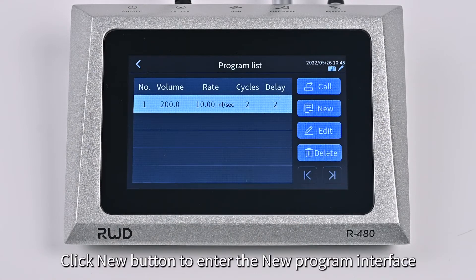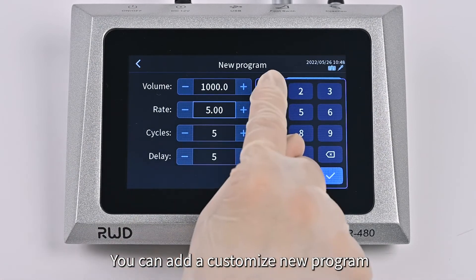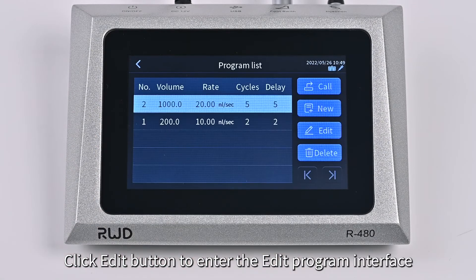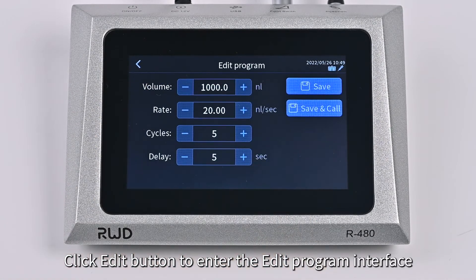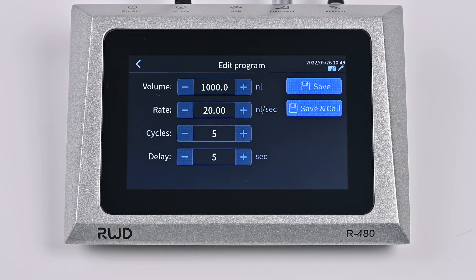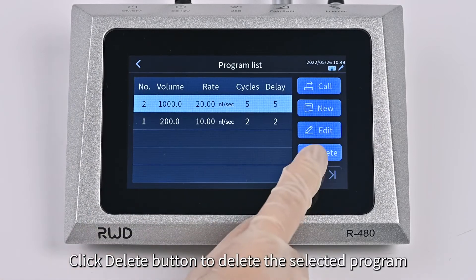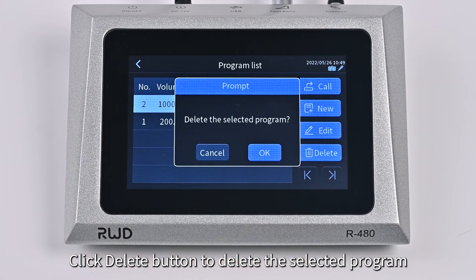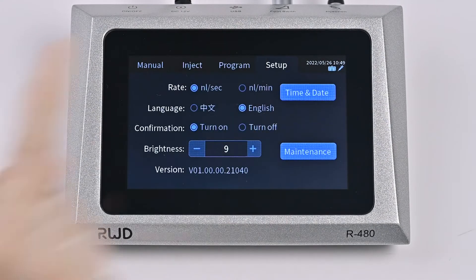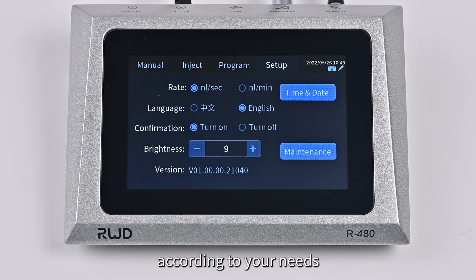Click the New button to enter the new program interface, where you can add a customized new program. Click the Edit button to enter the edit program interface, where you can modify the existing program. Click the Delete button to delete the selected program. Enter the Setup interface.